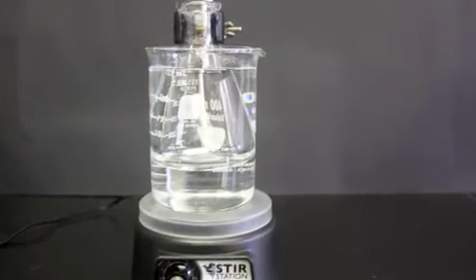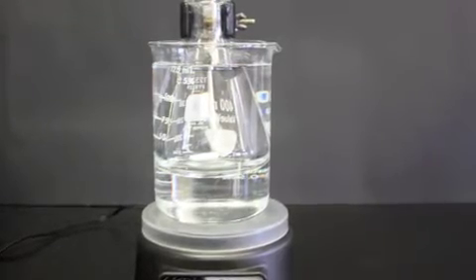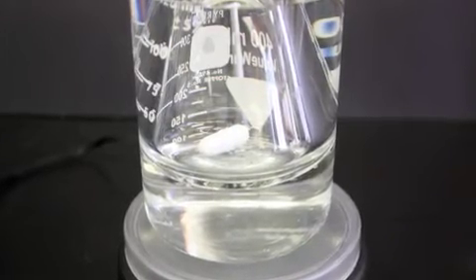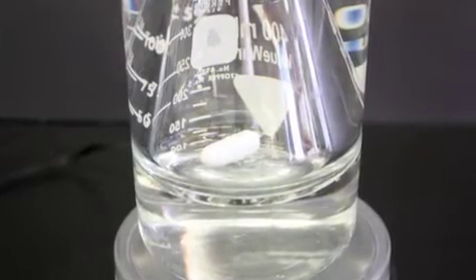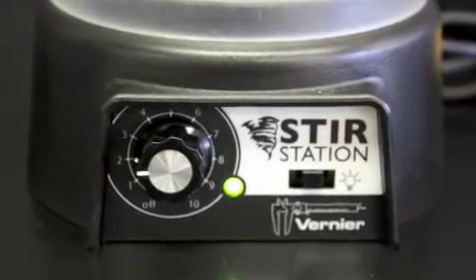Fill the 400 milliliter beaker just about to the neck of the flask with water and add a stir bar to the inside of the 125 milliliter flask. Even though the stir bar is well above the magnetic stirring base, the bar will still move inside the flask. Make note where you have set your stir station setting. It needs to remain constant on all trials in the lab.